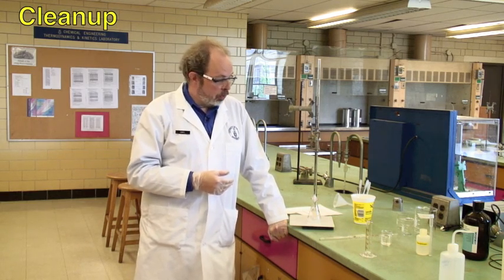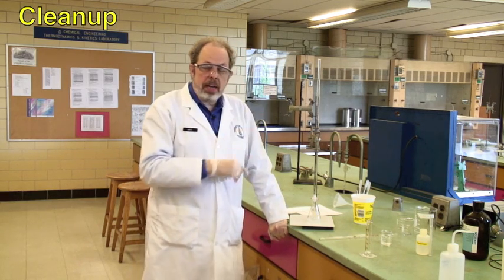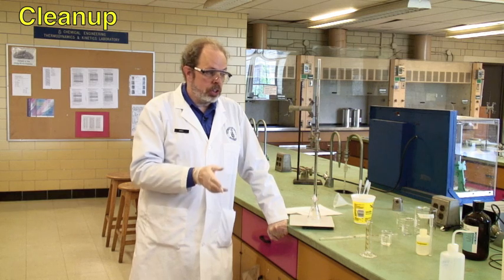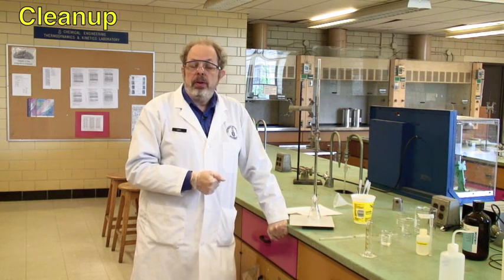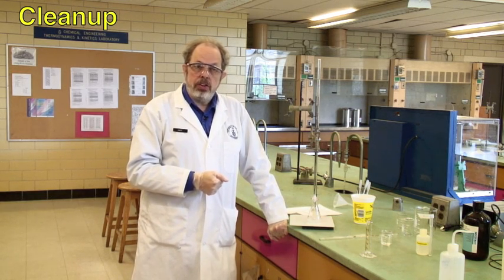Once you have finished doing the titrations, that is monitoring the ethyl acetate hydrolysis at three different temperatures, then you can clean up. All you need to do is put all of these down the sink with lots of running water. Please wash your glassware and away you go. You should now know how to monitor the hydrolysis of ethyl acetate by titrimetric means.